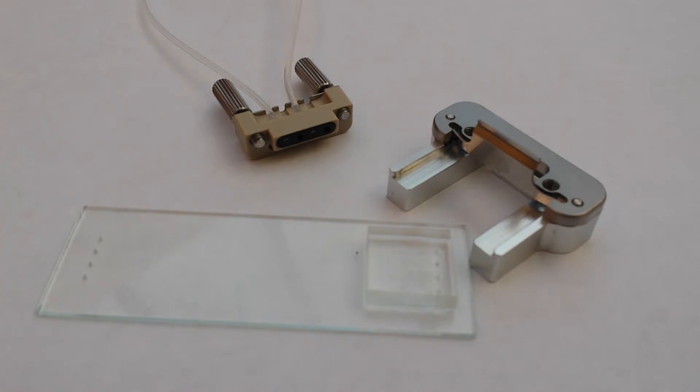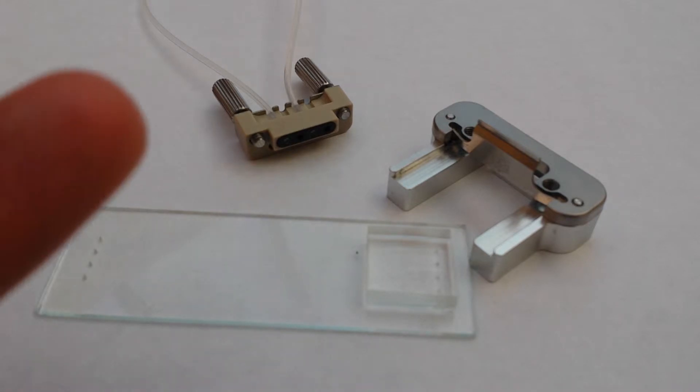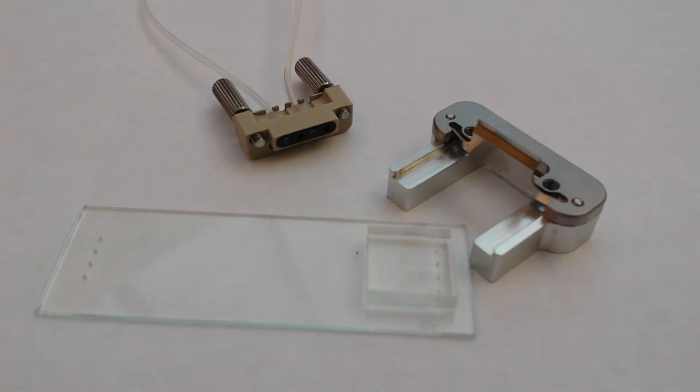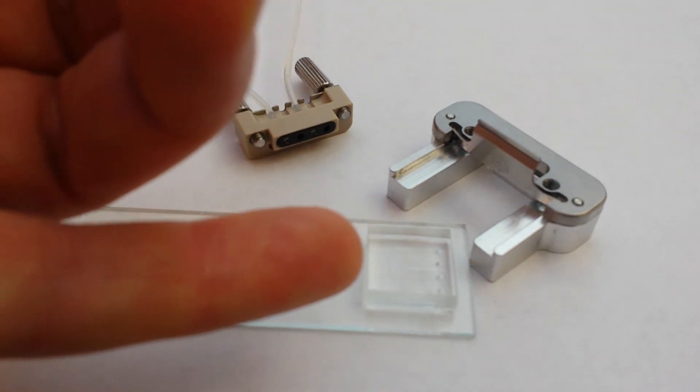The PDMS chip is designed by you, the slide is provided by Dolomite, the connector is provided by Dolomite, and the mounting block is also provided by Dolomite. This is really a good thing because the intellectual work should go into the PDMS part — that's where the novelty is. The connectors are not novel, so I'm a very strong advocate of standardizing on a connection type and letting a company like Dolomite provide the connectors, freeing scientists and engineers to be creative in the PDMS design.